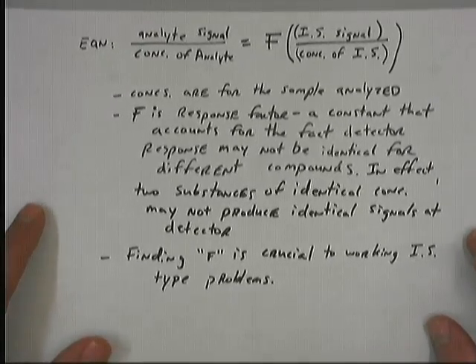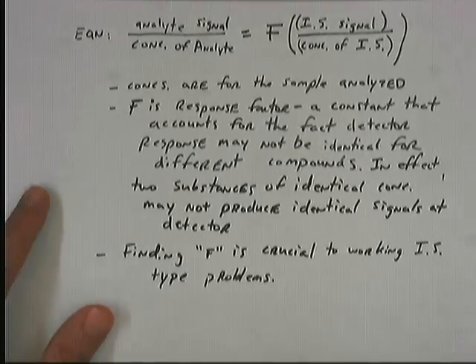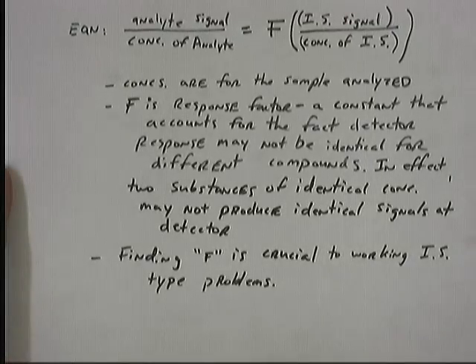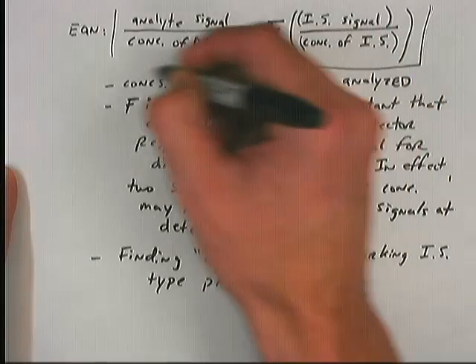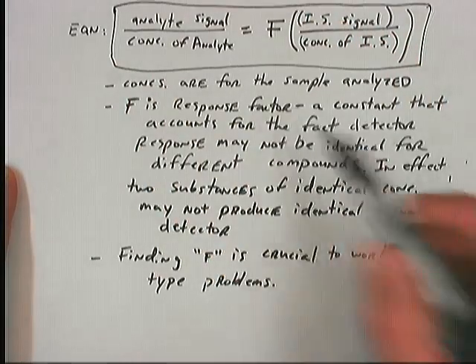Okay. The way that's done is through using the equations that are shown up here on this slide. I've pre-written a lot of this material just in the interest of time to explain it quickly in this video. You can always rewatch the video if you need to. Okay. The key equation for using internal standards is here at the top of this slide. I'm going to box it in for you, okay?